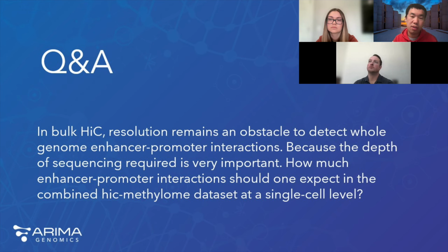but to conquer this sparsity in the data, I think there's a lot of software out there that can do that. For example, in our lab, a colleague, Jingtian Zhou, developed a method called scHiCluster. Basically, based on the single cell Hi-C data, it can do the imputation and get a much less noisy result. By combining those data, it can give you a good Hi-C analysis. And also other tools like Higashi or SnapHiC can, I think, all attack this problem.